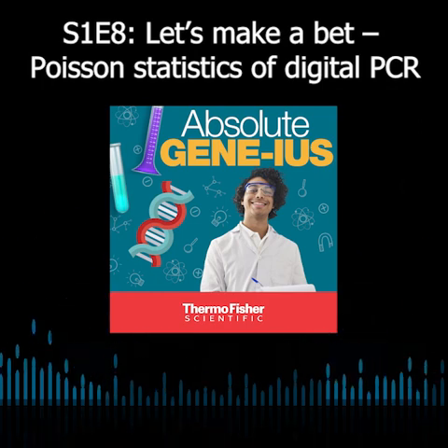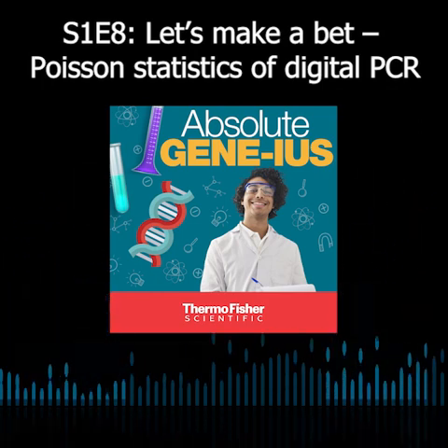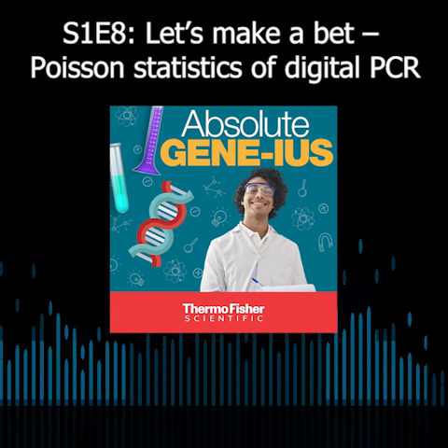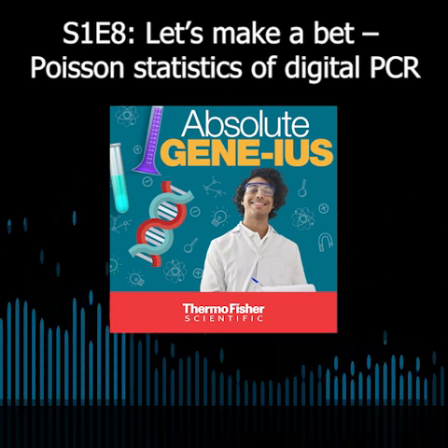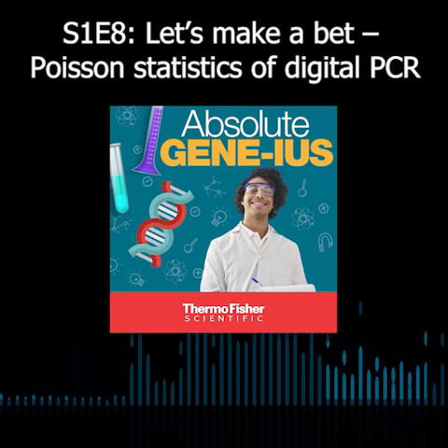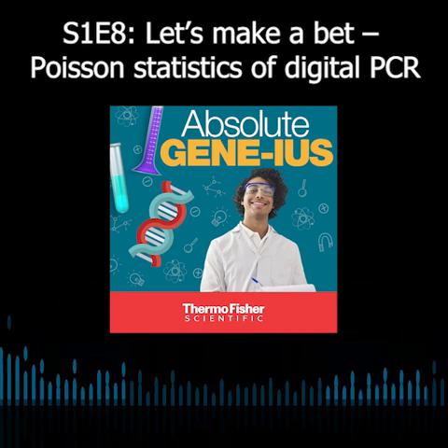Another question for you. We say it's a measure of yes and no, and you're looking at that endpoint data. The fluorescent intensity, does that ever play a factor? That threshold level, does that ever play a factor in the precision or the accuracy of the data?